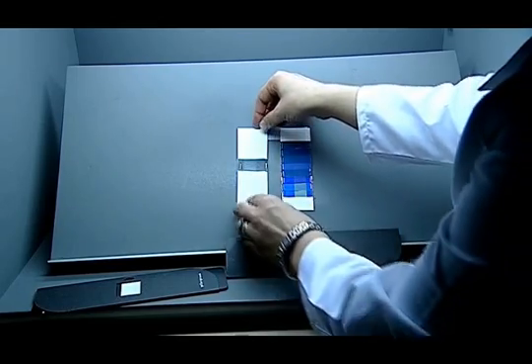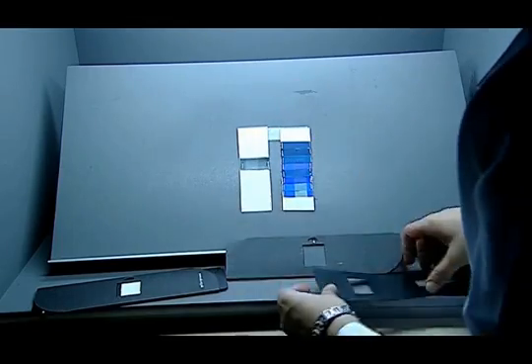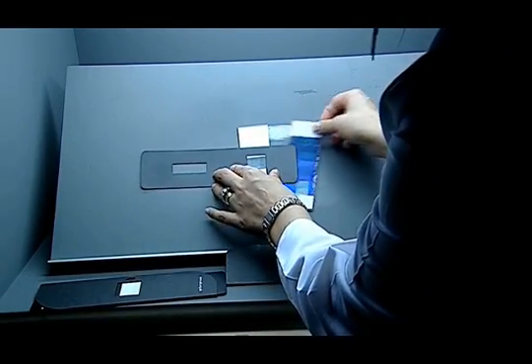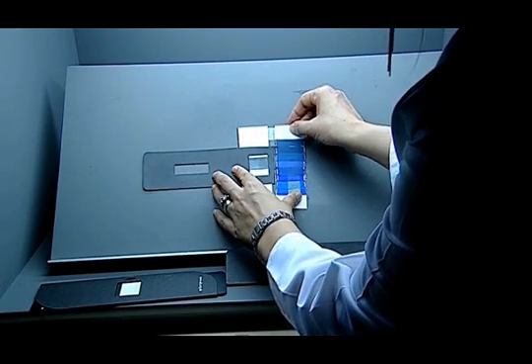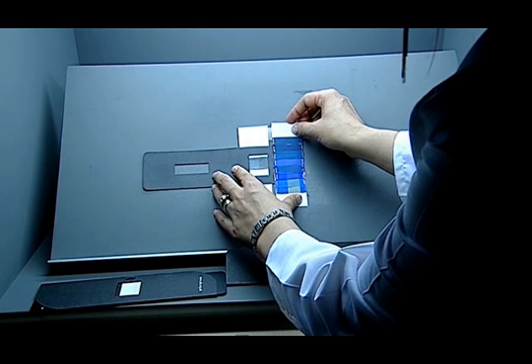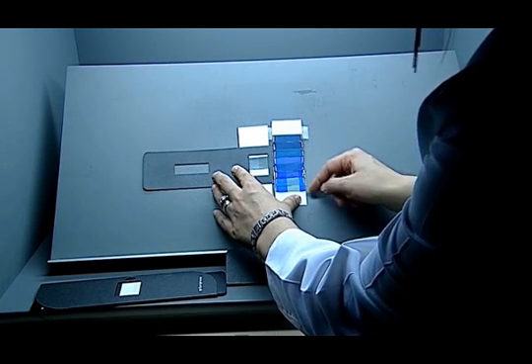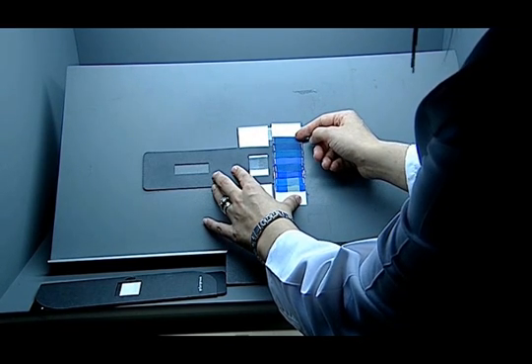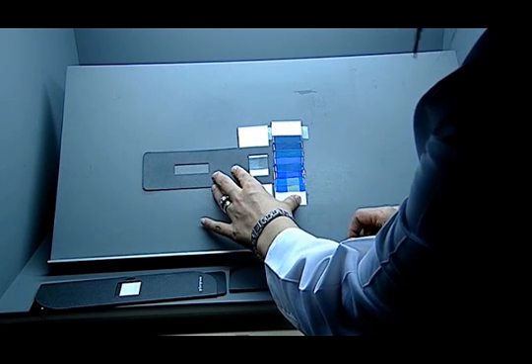In the test, the specimen is exposed to light over the same period of time. The tone difference between the section covered with a mask and the section exposed to light is compared with the blue scale. 1 means the worst and 8 means the best result on the blue scale. Interval values such as 5 and 6 can also be given.